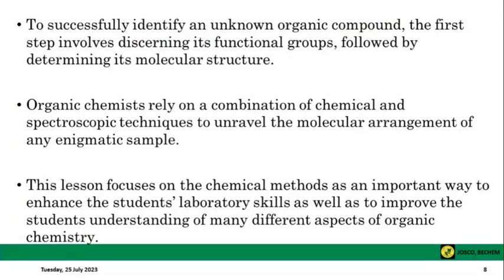Again, for you to be able to identify an unknown organic compound successfully, you should be able to know which kind of functional group you are interested in or you are looking for.